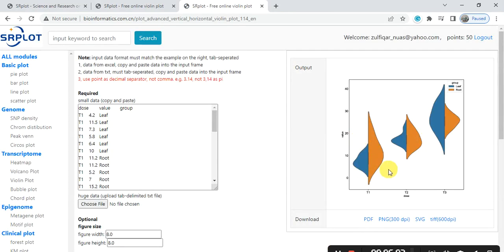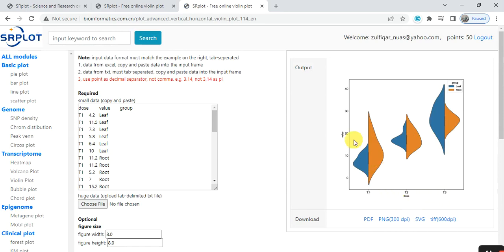And also, it gives you treatment 1, treatment 2, treatment 3. Here, it shows the doses and this is your values.